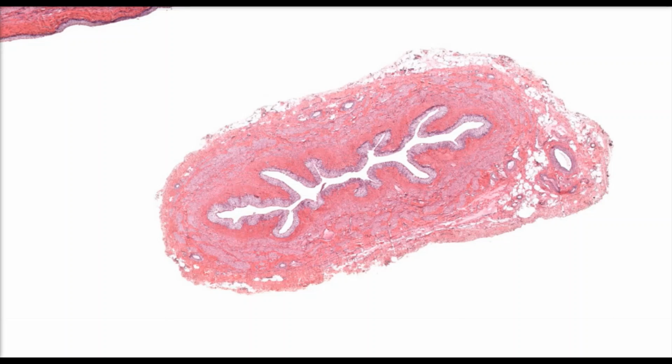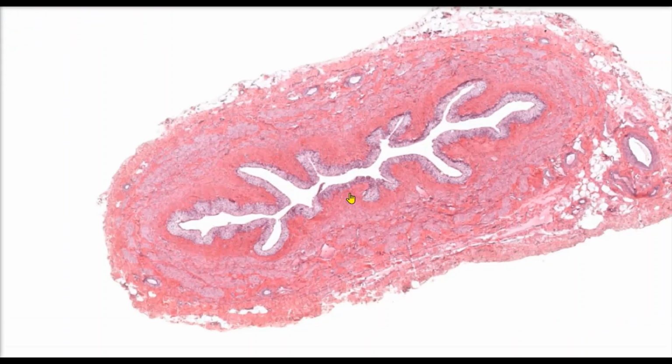The slide we're currently looking at is a ureter, the tube that carries urine from the kidney down to the urinary bladder. We find transitional epithelium here in the ureter as well as in the urinary bladder. Its primary function is to be able to expand as urine flows through this tube. Let's go ahead and zoom in so that we can see the transitional epithelium a little bit better.